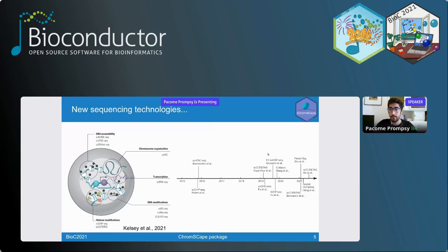For example, now there is high-throughput single-cell ChIP-seq or single-cell CUT&Tag, which allows to assess histone modifications in single cells, and Paired-Tag, which also embeds expression in the same cells as histone modification, or spatial CUT&Tag, which adds the spatial information and was pre-published on bioRxiv this year.